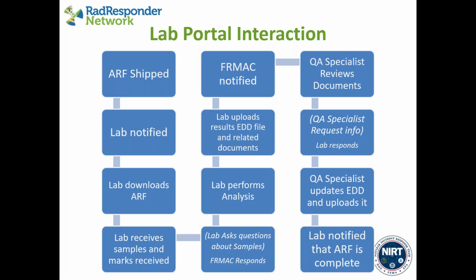On the back end of the process, we've improved the ability to get the results out of the system through an expanded data format that gives you all the metadata that you would ever need in a nice flat Excel table that you can pare down as needed. You can access this through the analytical results section of RadResponder or even through the map, where you can specify filters, draw a specific region as a filter, and export your data in one big file with all the different data types on separate tabs. So we're going to demonstrate all that today.